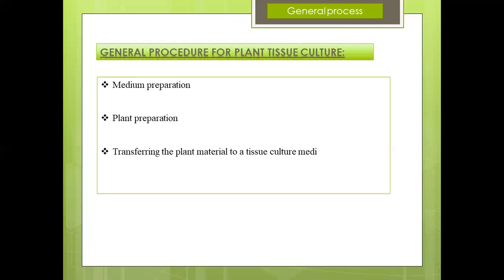Remove the plant part from the container and place it onto a sterile petri dish. Using a sterile blade, cut the plant material into smaller pieces of about 2 to 3 mm across, avoiding the parts that have been damaged by bleach. Using sterile forceps, place a section of the plant onto the medium, replace the lid and close tightly.